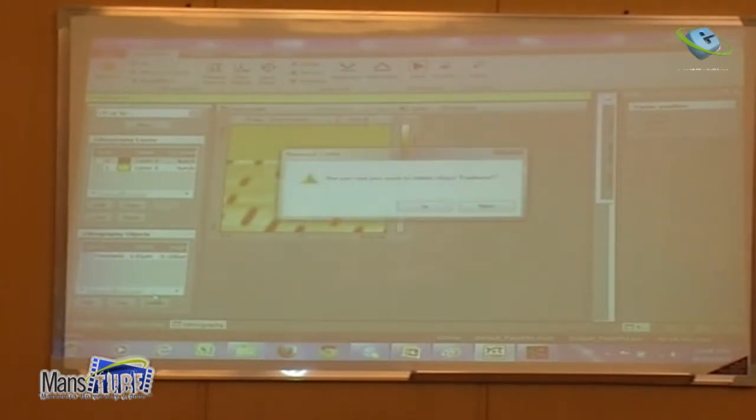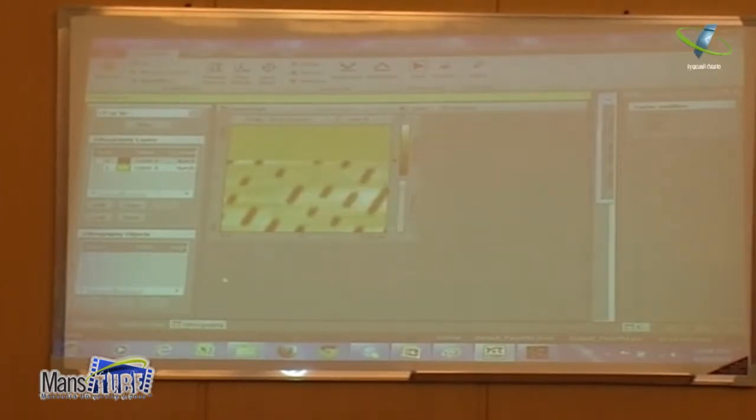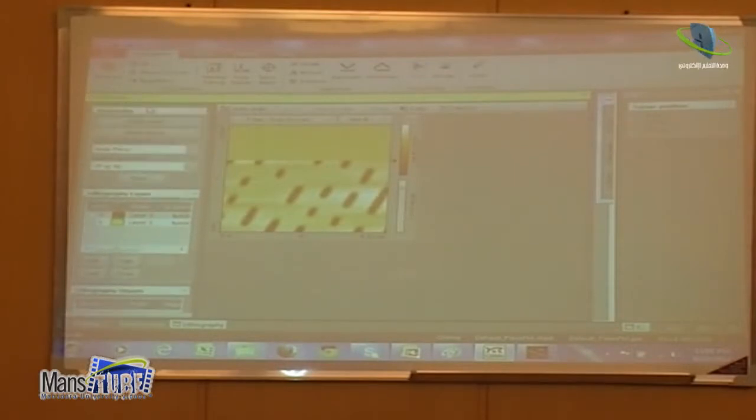This is plastic, CD. We can do oxidation, but you need materials that you can. Okay. So what I will do now, I will import maybe something different, vector. Let's say, import vectors.